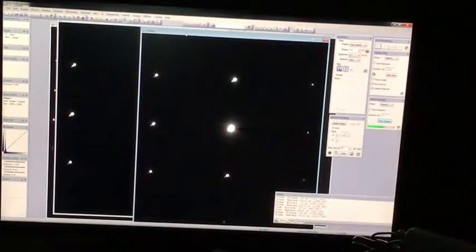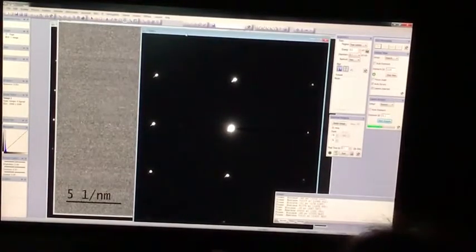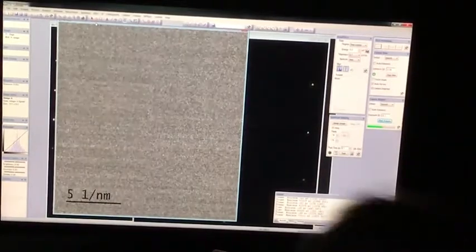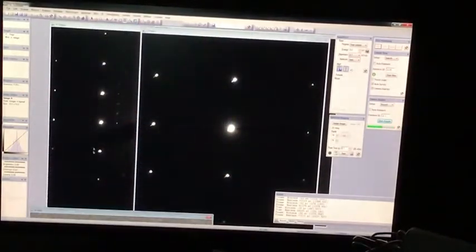Okay, we'll stop blasting the detector. We're fine. Didn't do anything. That's okay. All right. Now I'm going to save all of this. I'm going to move the view out of the way.